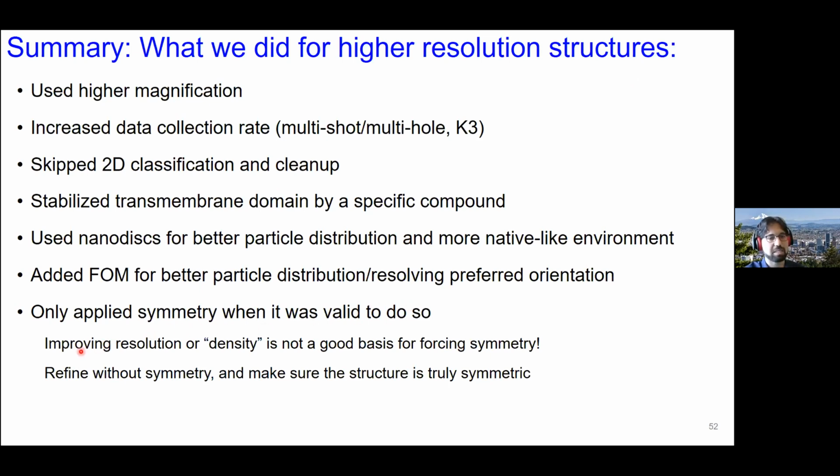And for us, that means if it improves your density and resolution, that's probably not a good enough basis to apply symmetry. What you really need to do is refine the structure without symmetry and then measure the deviation from symmetry.